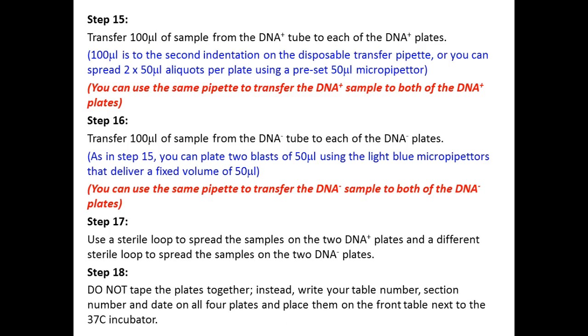Don't tape your plates together like it tells you to in your protocol, but I do want you guys to write your table numbers so that I know which tables to put them back out to. I don't know if you noticed, but your tables are numbered. So if you guys are 4, I think you're 3, I think you guys are 2. And then we'll stick them in the incubator, and by tomorrow we'll have glowing plates.